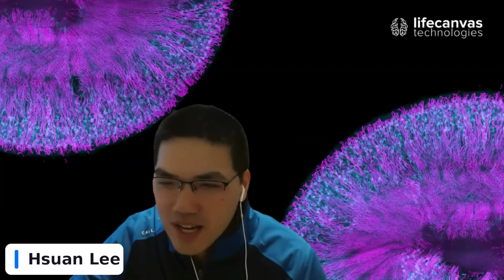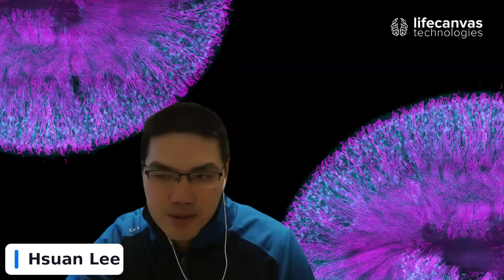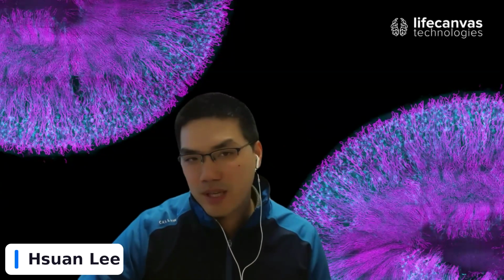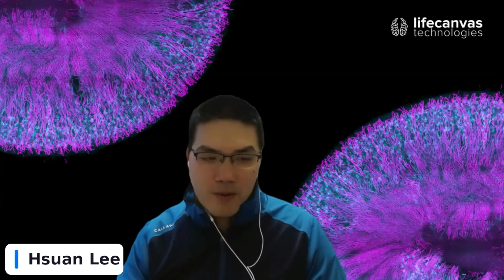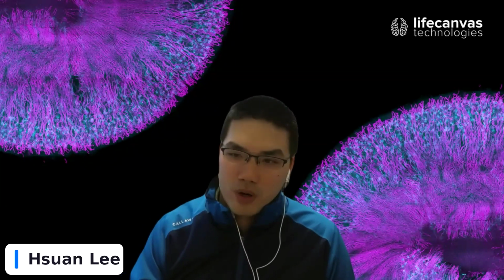Okay, another question for me from Wu Yu. What was the best resolution you could get with the organoids? So the highest magnification that we have on the DALISPIM is 15x, and the voxel size for that would be 0.4 micron-ish. But the axial resolution along the optical axis would be around 2 micron. But we might be able to toggle the axial resolution, like I mentioned before, if you're okay with compromising a little bit of the speed or the signal to noise ratio. So this is something that we can work with.